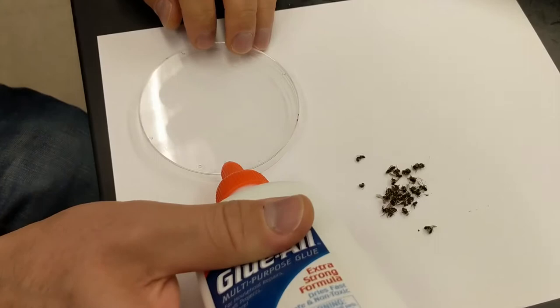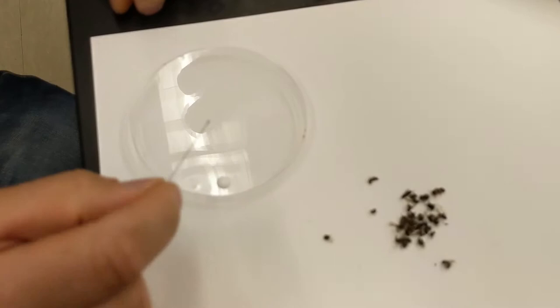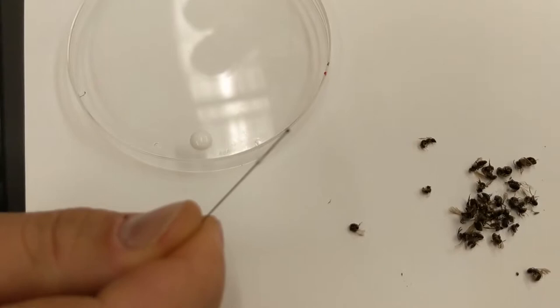So this is what I do: I put a little droplet of glue on a hard surface, and then I'll take a pin and I'm going to roll the glue around the pin like that.